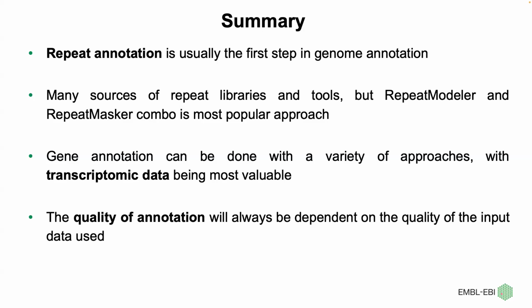And then the genome annotation can be done by using a variety of approaches. At Ensembl, we use evidence from transcriptomic data, from protein data, and from projection from a reference genome. So the quality of annotation will always be dependent on the quality of the input data used.